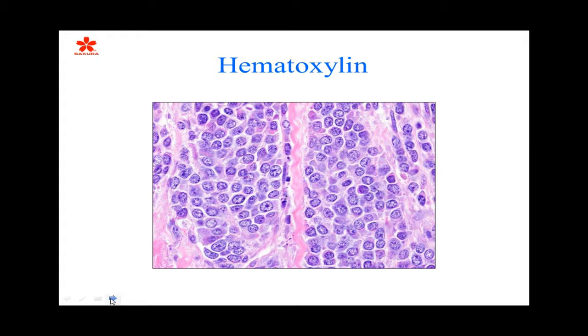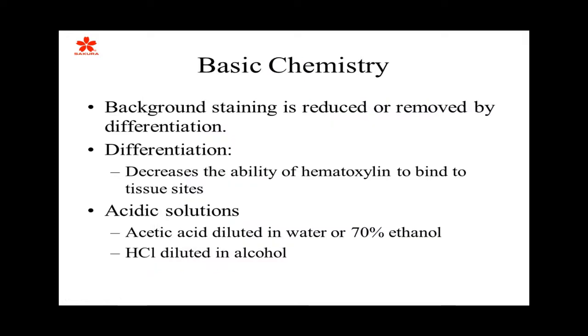And sometimes I have a concern about using a slide that has so much richness in nuclear staining that we don't really see a balance, such as using a lymph node. Some labs do that, and I certainly couldn't speak against that. I have a concern about that because there's so much nuclear staining that it sometimes masks out your eosinophilic staining. So I often recommend that you use a tissue source that has a lot more balance of nuclear and cytoplasmic material.